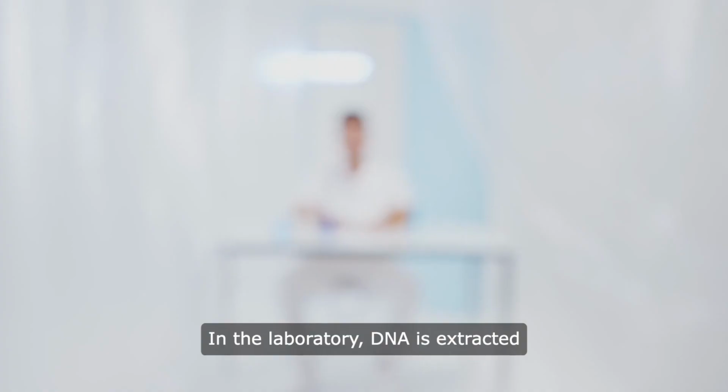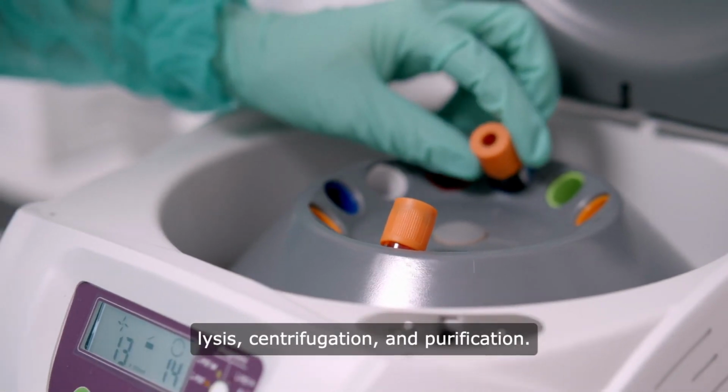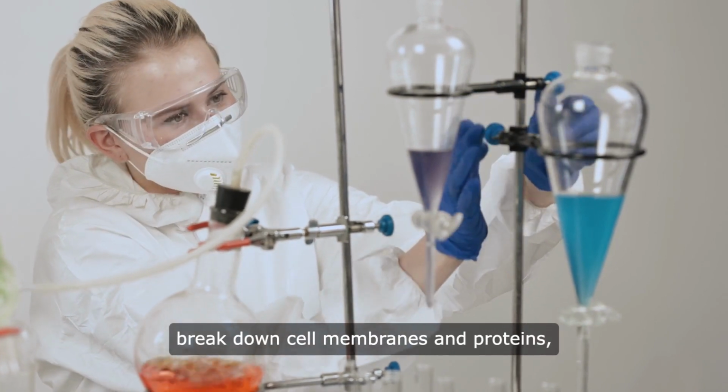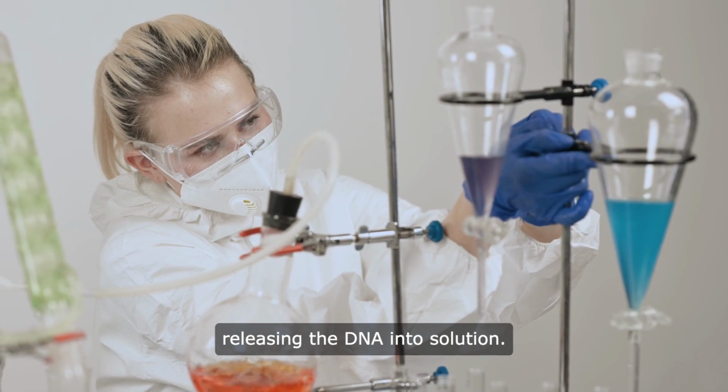DNA extraction. In the laboratory, DNA is extracted from the collected samples using various techniques such as cell lysis, centrifugation, and purification. Enzymes and chemicals are used to break down cell membranes and proteins, releasing the DNA into solution.